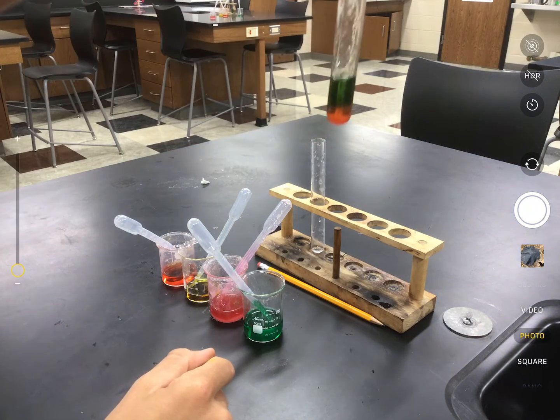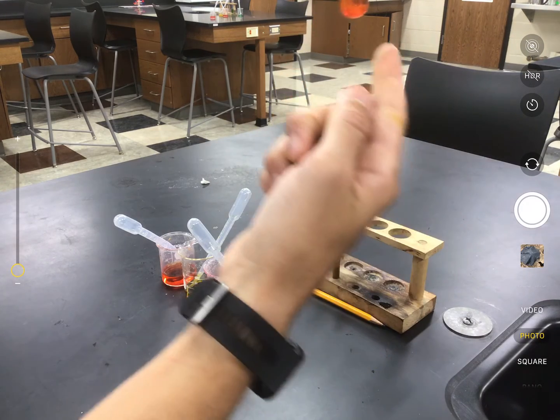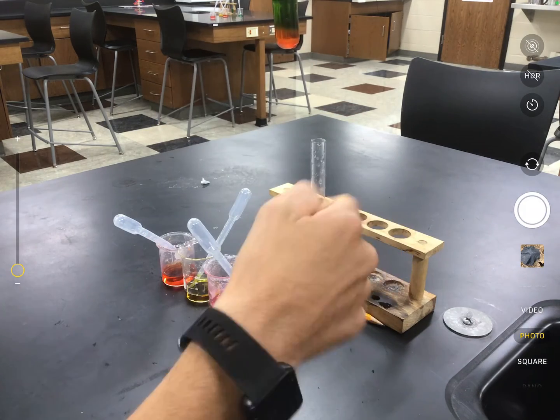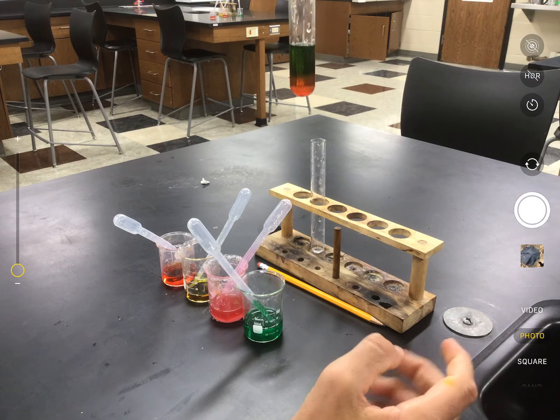And then when we release it, we have our density gradient. Now it's still sorting out a little bit. What we have is red on the bottom, then we have orange, then we have a small yellow layer, and then we have green. And so based on this, we're going to be able to see the different densities of different liquids line up.